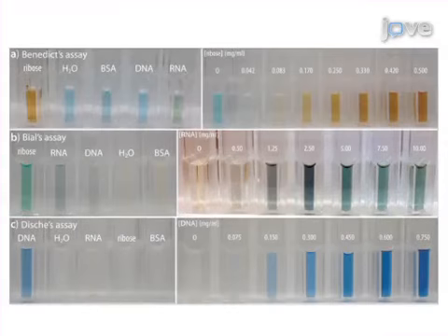The results show the type of biopolymer based on readily distinguished color products formed by the differential reactivities of sugar-based components in the sample, which can be analyzed against standard curves using spectrophotometric measurements.